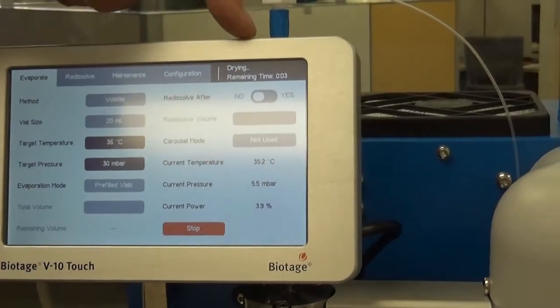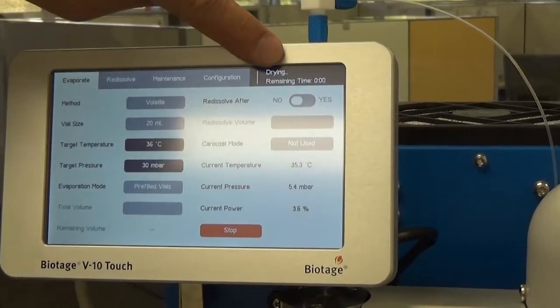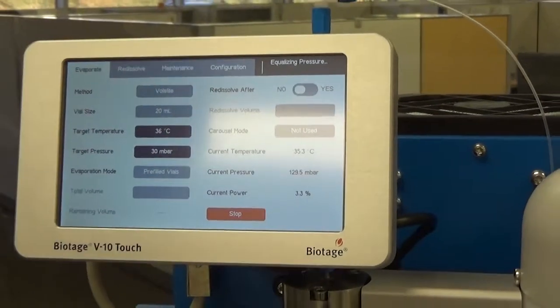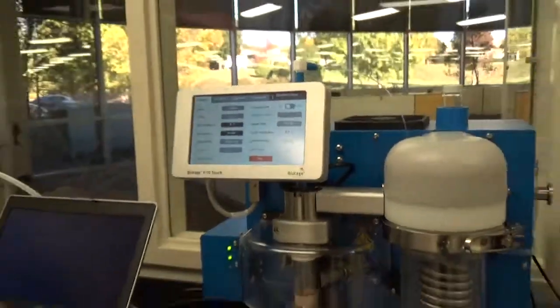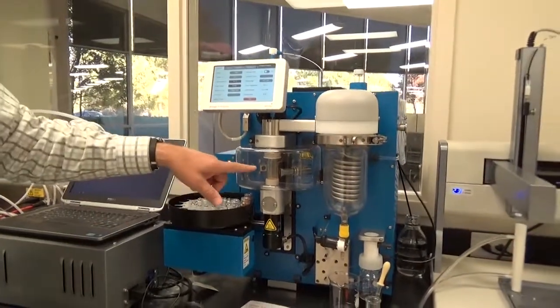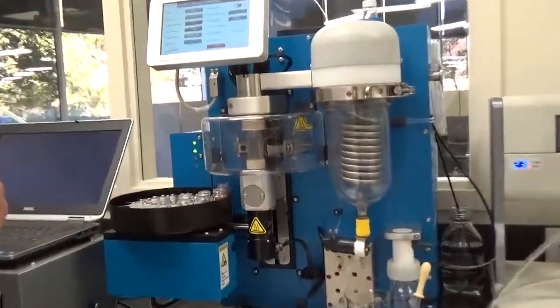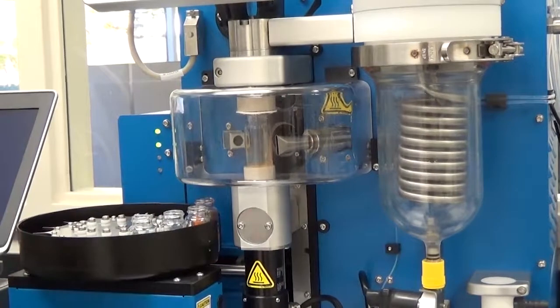And you'll see here in just a moment, it's going to be counting down to zero. And now you can hear it begin to equalize pressure. What it's doing is it's allowing air back into the vial. And you can see the vial coming down now.